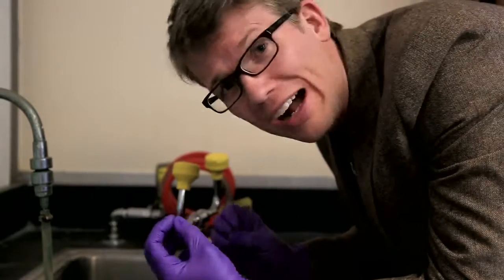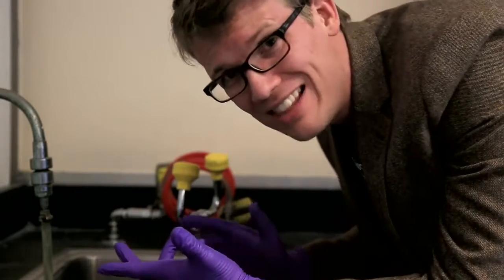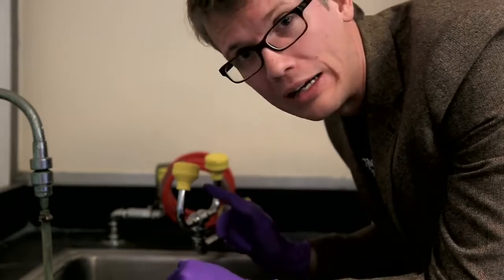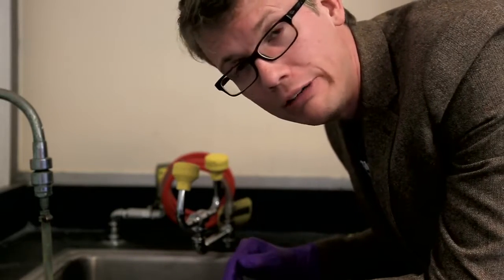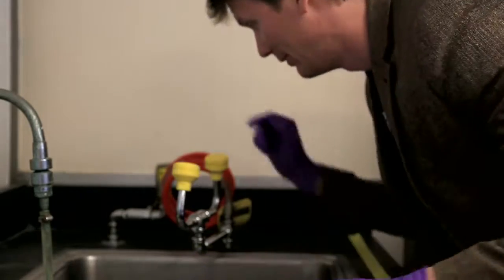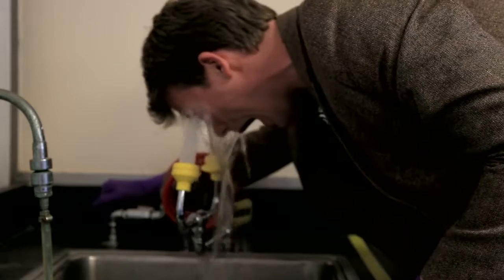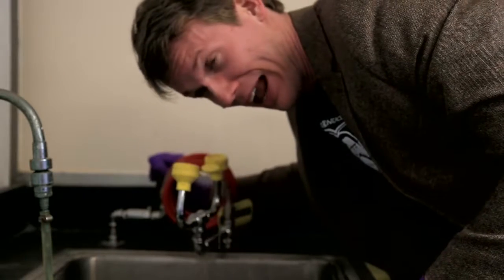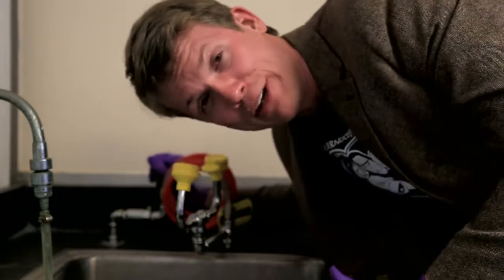And if you feel like your eyes are starting to tingle or hurt, or even if you don't know how something might have gotten in there, use the eye wash, because it never hurts to be careful, and you know, we've all wondered what it feels like. I've actually never done this, so this will be a new experience for me. It does not feel particularly pleasant. But it's better than having your eyes burned out.